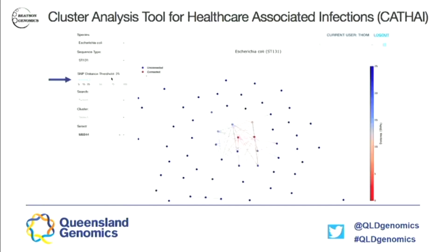Cluster analysis is an alternative method of looking at the relatedness between samples. This graph has been developed to visualise clusters of samples depending on a user-defined SNP threshold. We can give the maximum number of SNP differences that are between samples, and it will draw links between them in this cluster graph. This is useful for visualising an outbreak. And because this is also using SNP differences, it's dependent on the reference. If we did use a reference that was more distant, and we're comparing less of the overall genome, we might miss some of those SNPs, and 2 samples might have a link falsely drawn between them. But if we reanalyse the data with a more appropriate reference, we might see more of those differences, and that link might disappear.